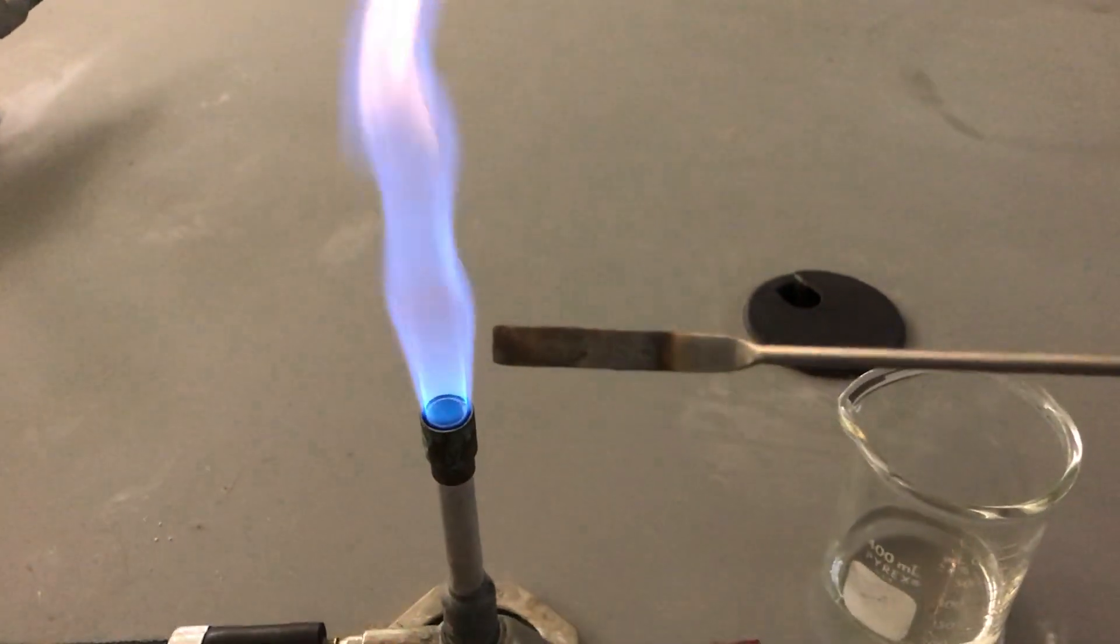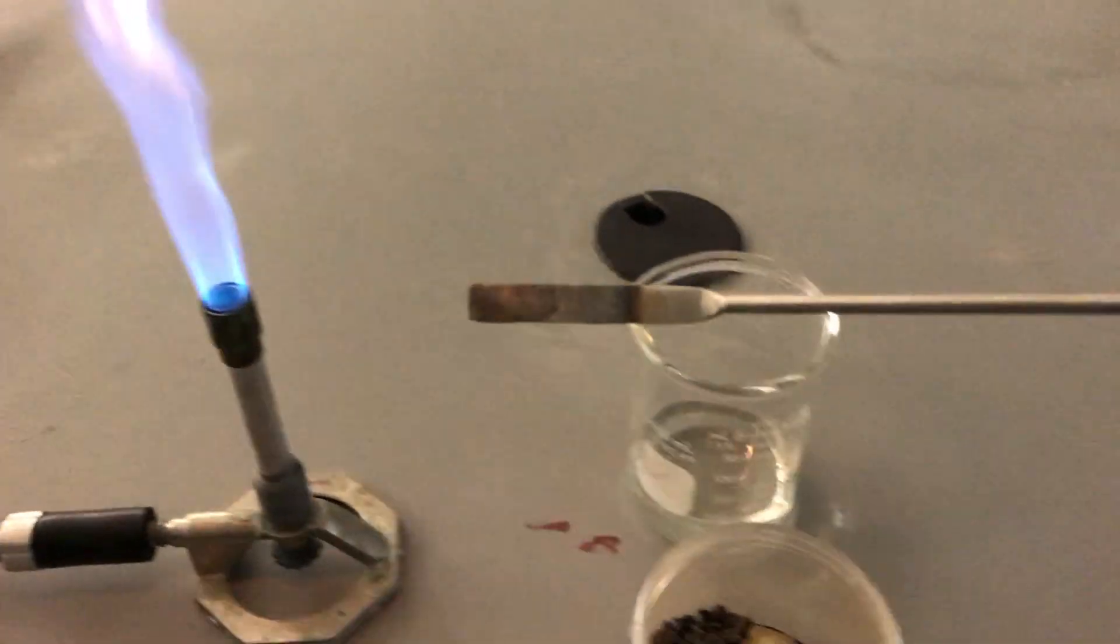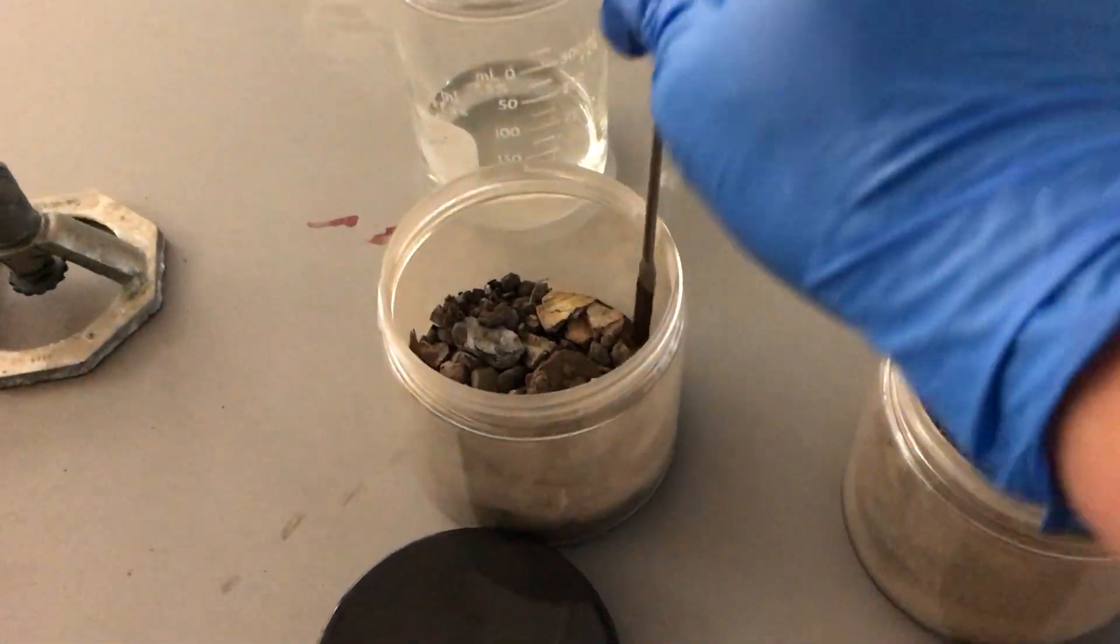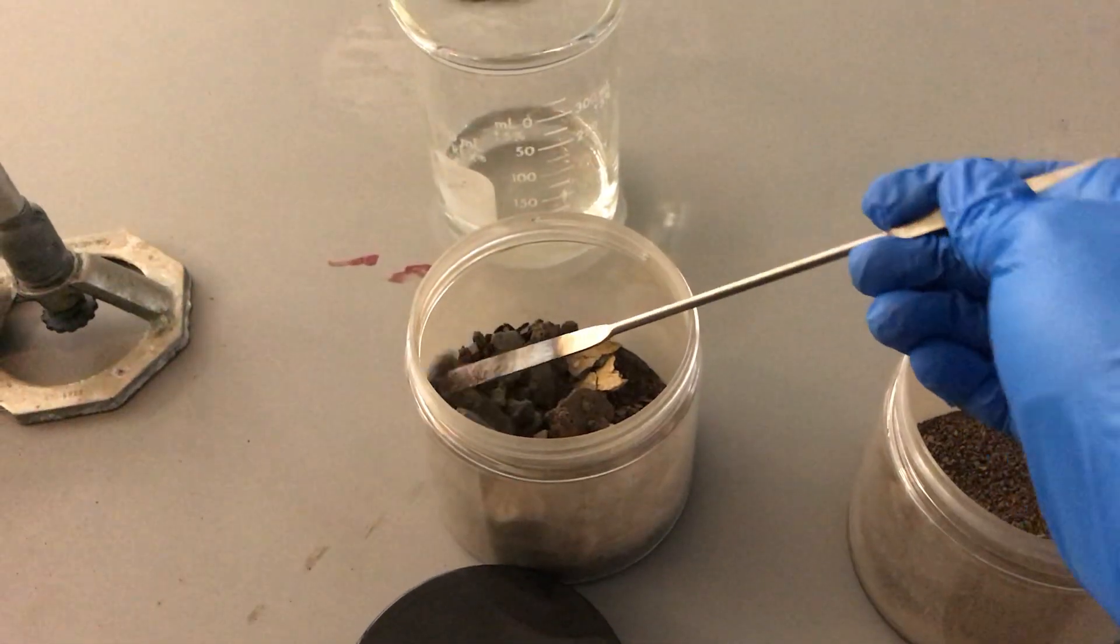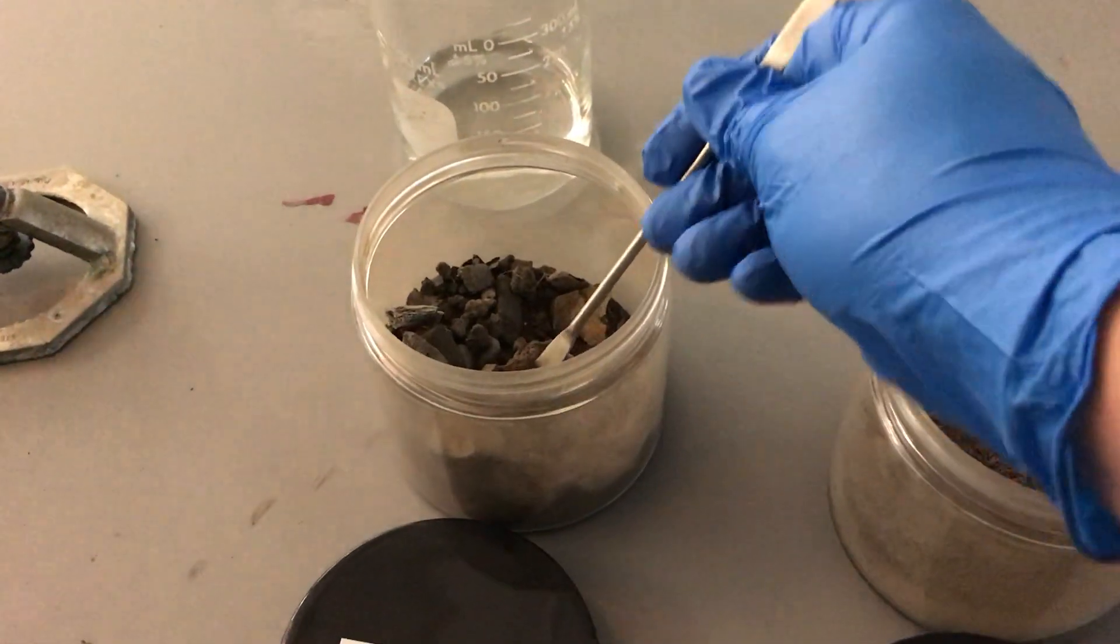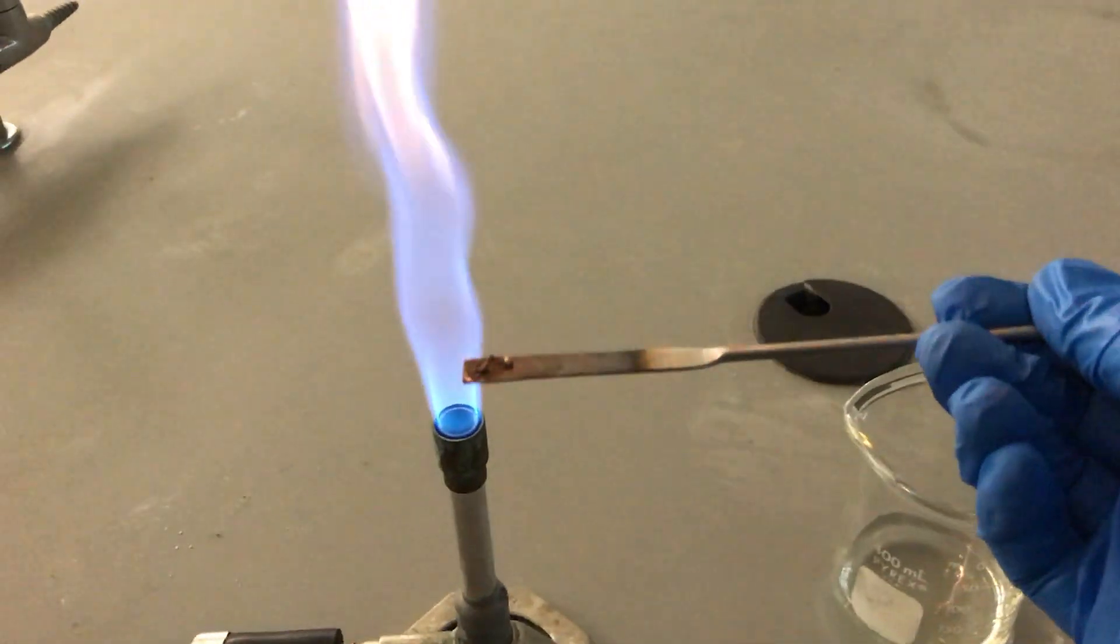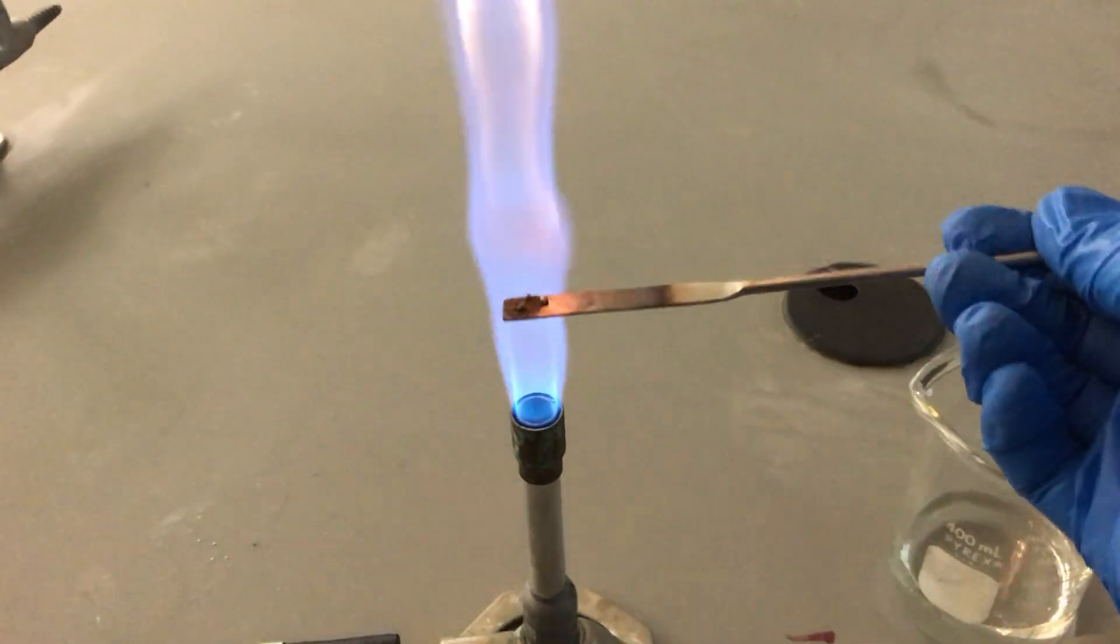Once our spatula is flamed off, we're going to take a spatula full of our first soil sample, which is going to be our crime scene sample. We're just going to introduce it and pick up a few granules of the soil itself, like so.